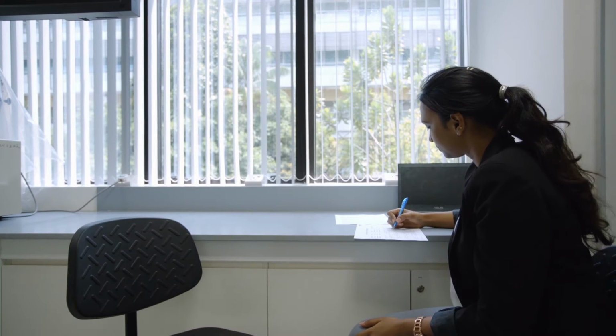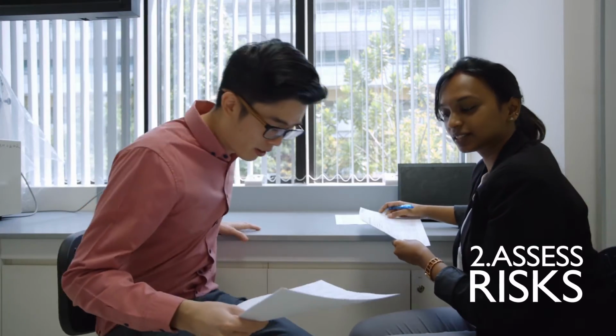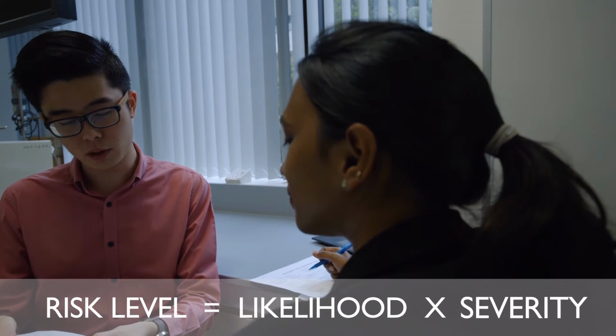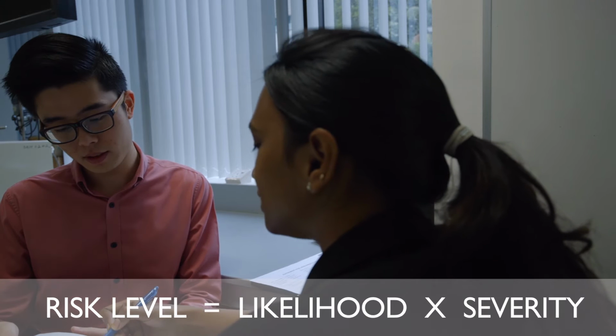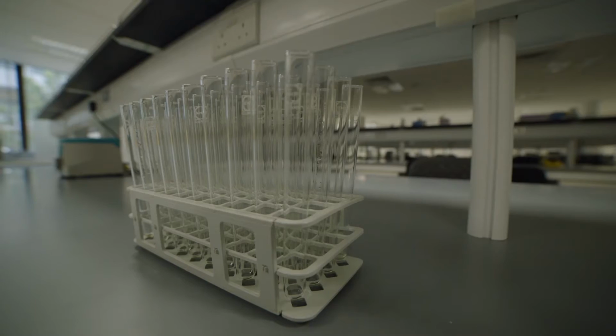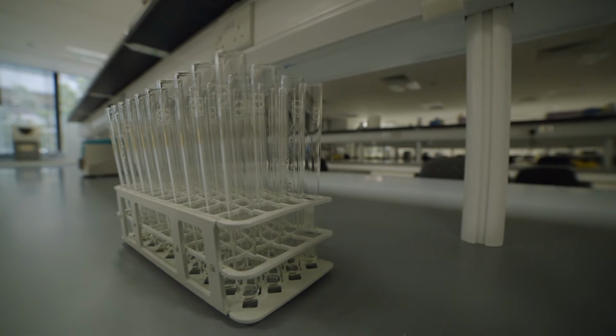Once the hazards have been identified, the next step is to evaluate and assess risk levels. Risk level is the product of the likelihood and severity of the hazard causing injury or ill health to you or others. Let us use an example to illustrate this point.